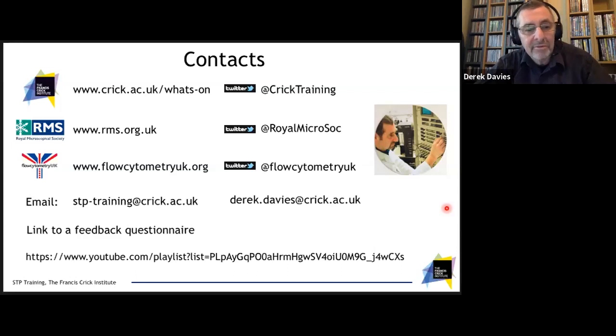So it will say, actually, this reagent is not available in this color, so you have to fit it in these ones. I think where some of these aren't quite perfect is that the staining pattern is often not taken into account. But sometimes we don't know that. But they are a good starting point, and I think in the coming years these will be refined much more. So at the moment I would use maybe a combination of those, and then look at the combination they've come up with and see whether that really fits with your biological question and the cytometer you're going to run those on.